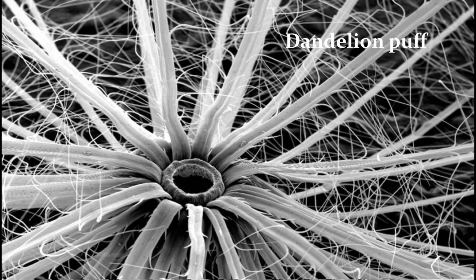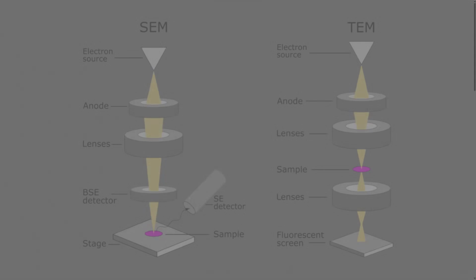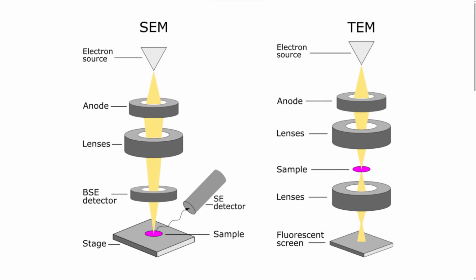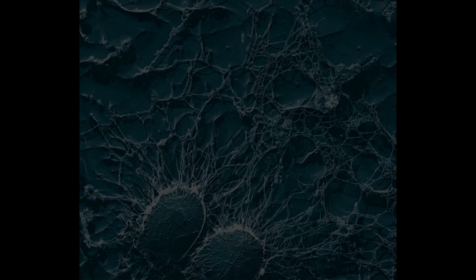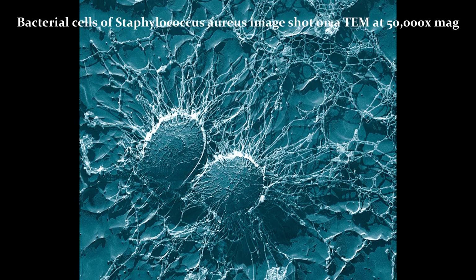This gives you an idea about the resolution that scanning electron microscopy gives us. There's also transmission electron microscopy, TEM, and I had the opportunity to work with those. They work slightly differently, and we can talk about this in future videos, so you can just research them yourself. But they require you to prepare a very thin sample, and the beam goes through the sample, and according to the shadow, you build the image of your sample.